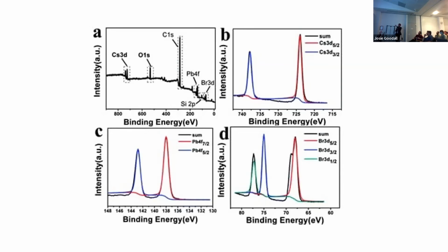Yeah, that's exactly it. That could definitely be what's happening. And again, every single one is bad, all four. So this one, really bad. Yeah, so maybe it's this. I think you're right. It's similar to this, but they cut it off. They thought it looked bad, but not indeed.